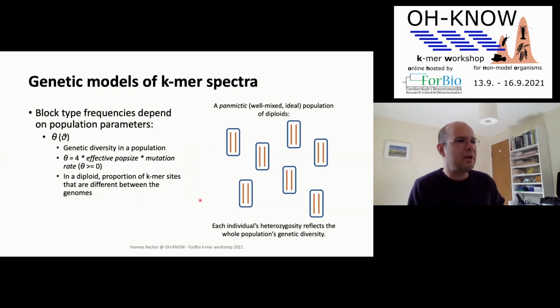And now knowing this, you already probably have an intuition about diploid K-mer spectra. The more heterozygous your diploid is, the higher is this 1n peak, because this is where the heterozygous K-mers go. And if it is very little heterozygous, then this heterozygous peak is very low, and the 2n peak is higher.